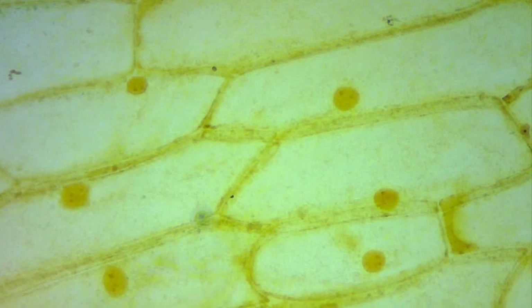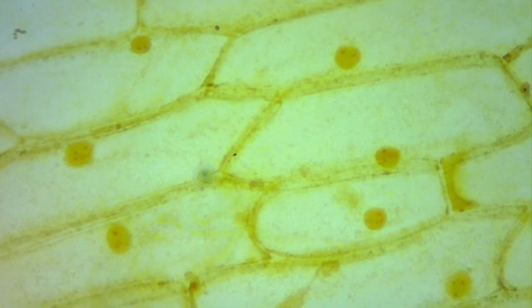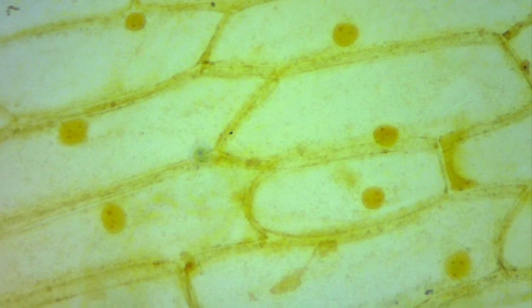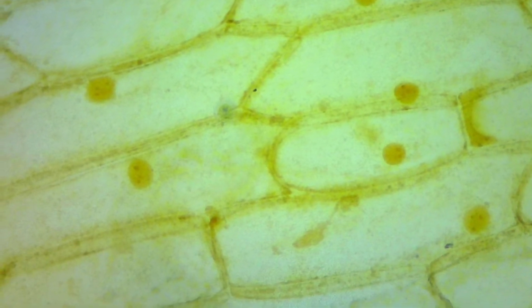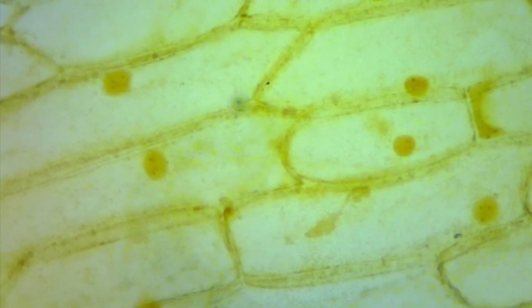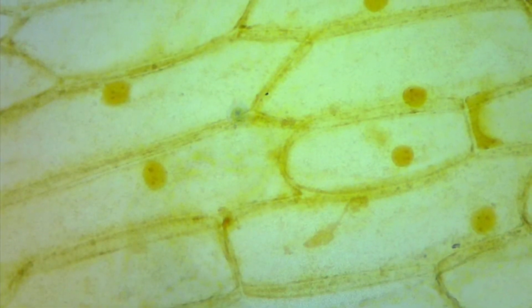What we didn't see was a large vacuole, the nuclear membrane, the plasma membrane, the chloroplast, and cytoplasm. The organelles that are not seen should be represented by a dotted line. The organelles need to be listed with their respective function.